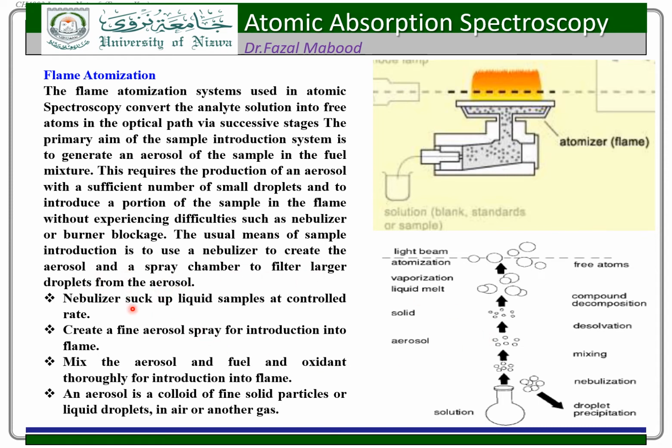So here you see nebulizers suck up liquid sample at a controlled rate. The first stage is nebulization. The nebulizer sucks the solution in, in the form of droplets, creating a fine aerosol spray for introduction into the flame. Mix the aerosol and fuel and oxidant thoroughly for introduction into the flame.